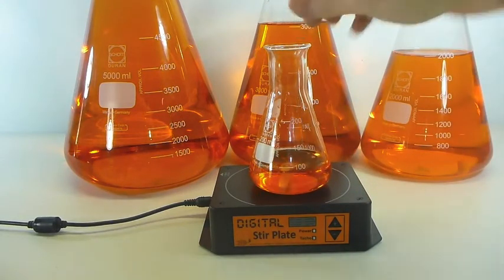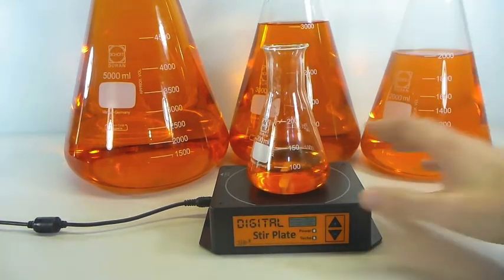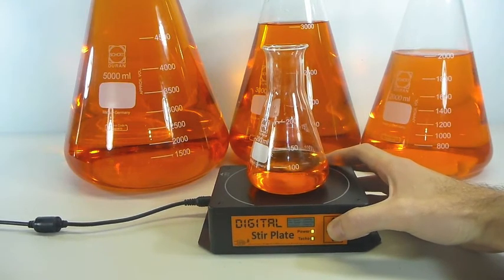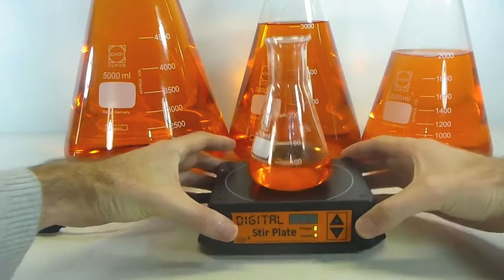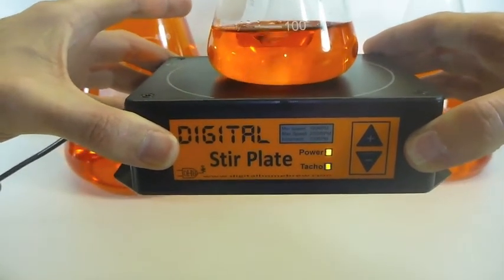What we've got here is a 200 mil Erlenmeyer flask and just our normal 30mm stir bar. And if I set up the speed to 100, 200, 300 RPM, it will stir it quite well — quite effectively — it's not going to be too big for it or anything like that. This is also where the digital stir plate really shines because it's got a lot of fine control at these lower RPMs as well.